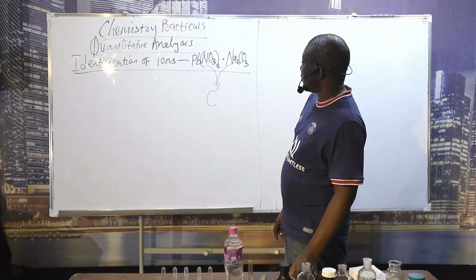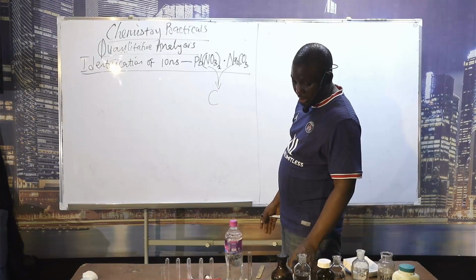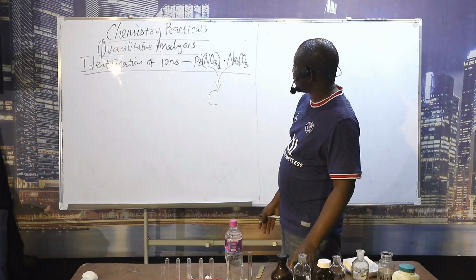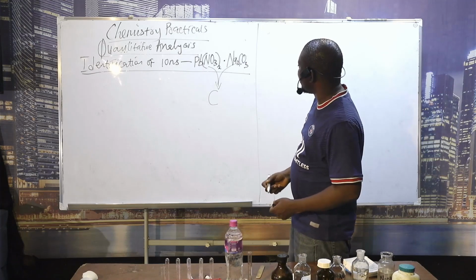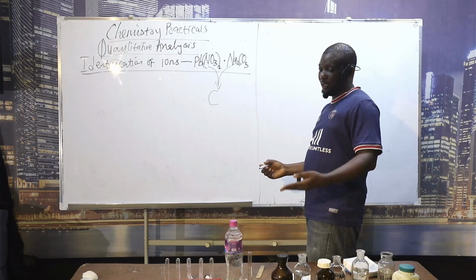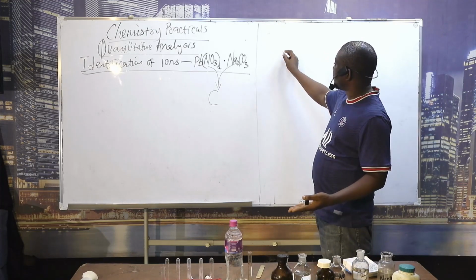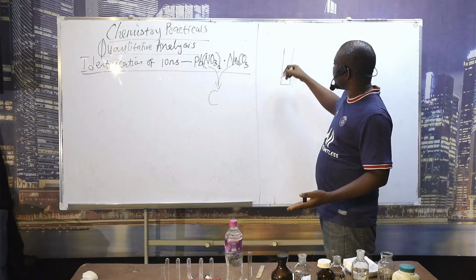Solubility is to know the extent to which the salts dissolve in water. Like I said in this video, before I start the practical aspect of this, I would like to do the theoretical part of it. So I think this is the test tube.